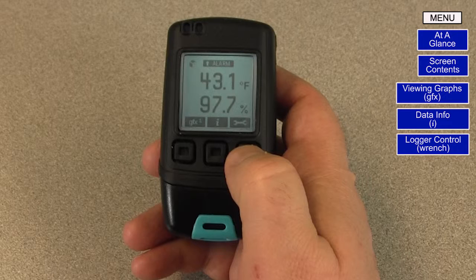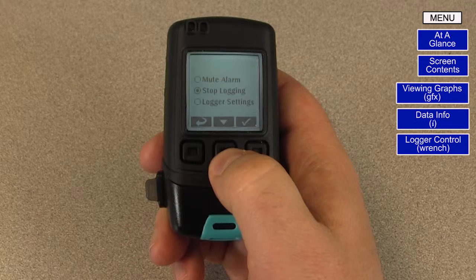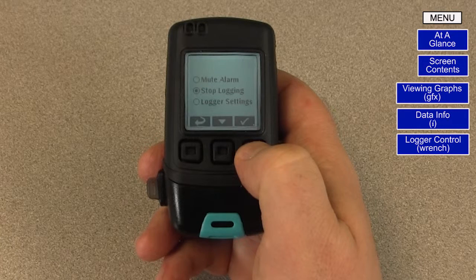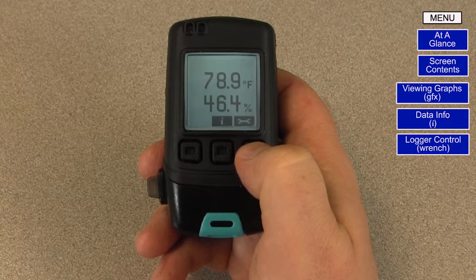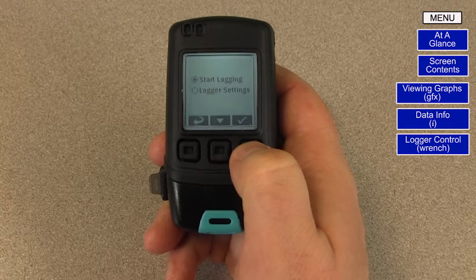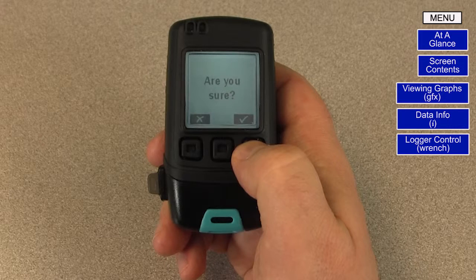Let's assume you wish to download the data to your PC, but before you do, you wish to silence the alarm and stop the data logger from logging at the same time. Press the button under the wrench, then press the button under the triangle one time so that Stop Logging is selected. Press the button under the check mark to execute, and again to confirm. The alarm will now be silenced, logging will have stopped, and you will return to the default screen. If you wish to start logging again, push the button below the wrench twice if the backlight is off, and press the button under the check mark to execute Start Logging, then confirm.